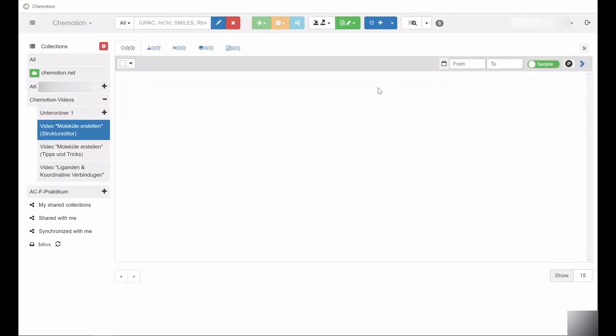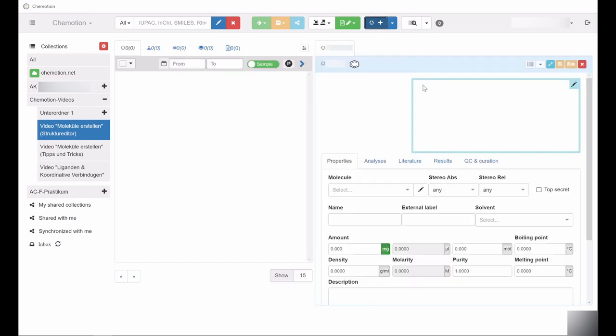This video shows what kind of additional information you can include on a chemical compound once it has been created or imported into the Chemotion ELN.